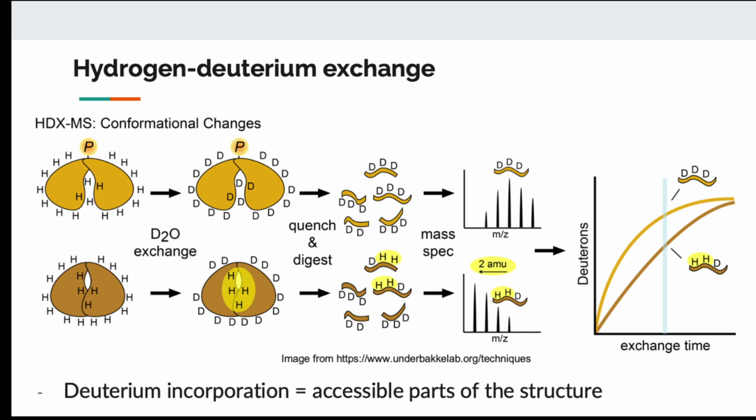And whichever part of the protein that those peptides can be mapped to, like the peptide that I highlight in yellow, those are the parts that open up when this is phosphorylated. So we can understand the change in protein conformation, the change in solvent accessibility, by probing how deuterium replaces hydrogen inside the protein. So this is one of our techniques.